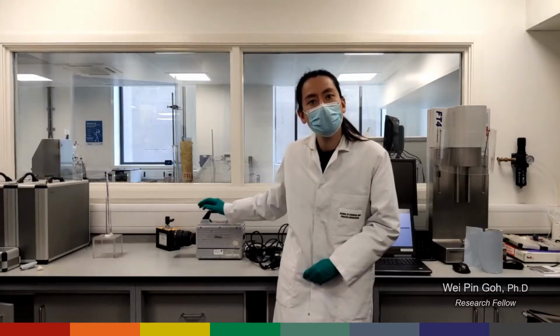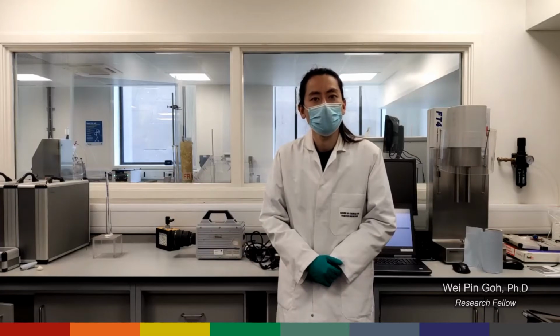Are you someone who keeps dropping stuff everywhere? I'll give you a few seconds to think about it. Well, I personally don't, but today I'm going to drop things deliberately and tell you the science about it with the help of this instrument. Who knows dropping stuff could be so useful? Just a spoiler. The keywords today are adhesion, interfacial energy, and impact. Let's have a look at the setup, shall we?